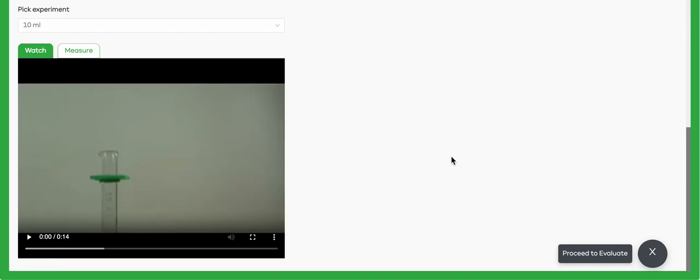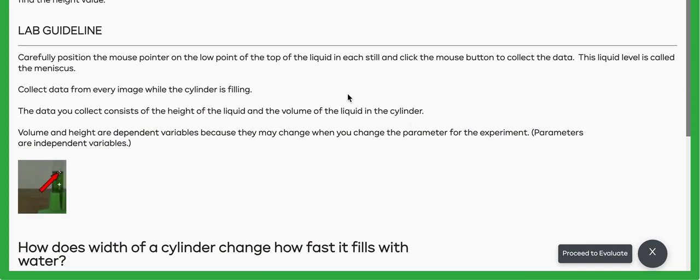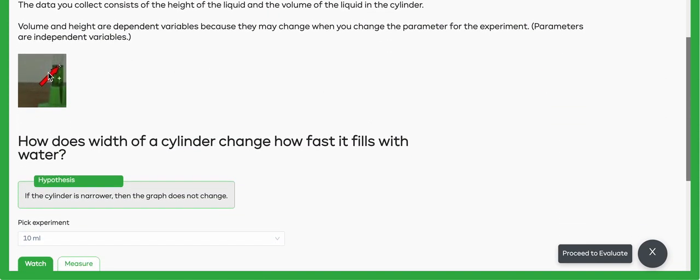Welcome to the Smart Science video about how to measure for the volume graphs lab. Notice at the top the Explorer page, a brief description of the lab, and then a guideline on how to measure.